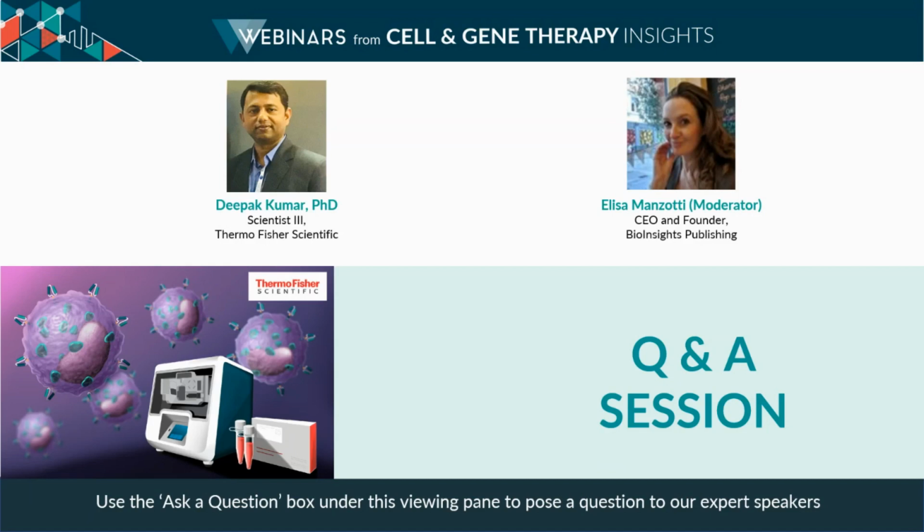That's great, thank you. Another question in from the audience. Are the cytokine concentrations altered from normal culture conditions at any point before, during, or after electroporation?